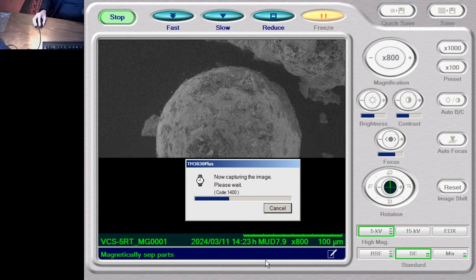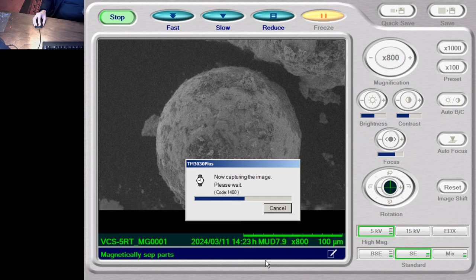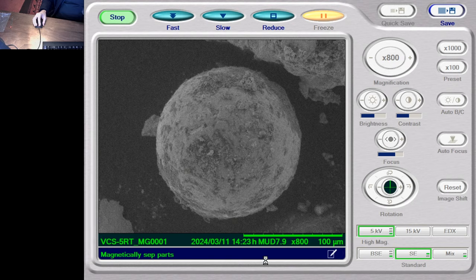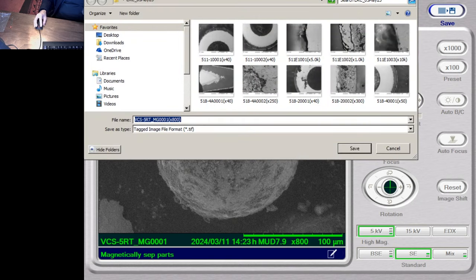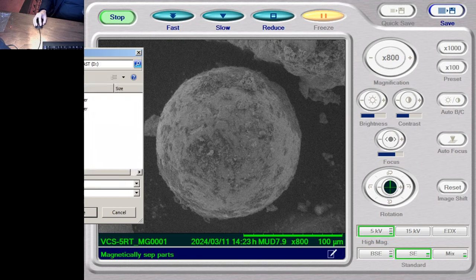This is a large sphere, by the way. It's 100 microns. So it'd be interesting to see what this actually is comprised of. Okay, so I'm going to save that.